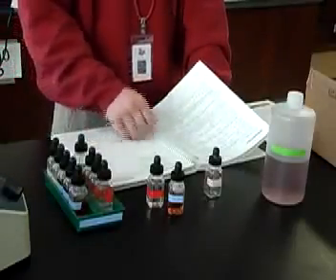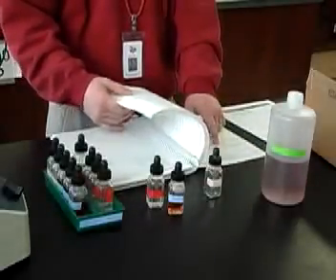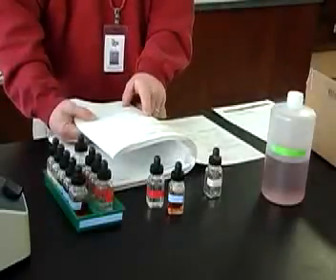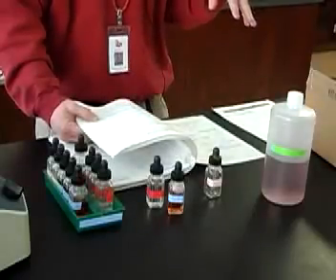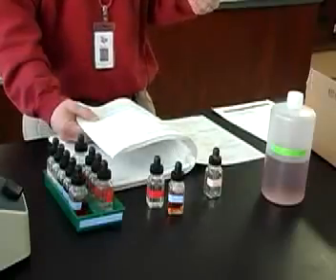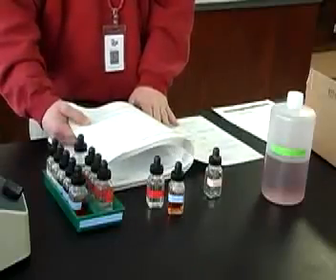The second thing is that when you add NaOH and H2O2 to them, which one of those ions in there will actually dissolve? Now we ruled out manganese, we ruled out cobalt, we ruled out iron. What about bismuth or zinc? Will one of those dissolve when you add H2O2 and NaOH? Look at your flowchart.